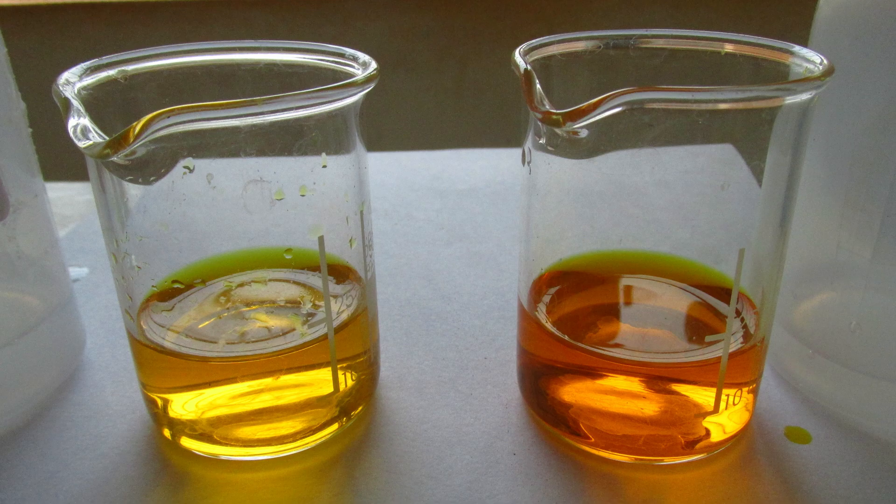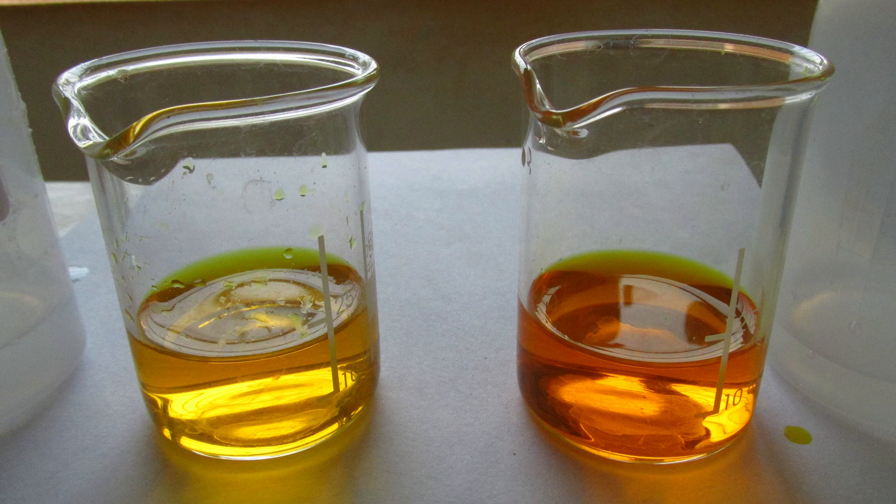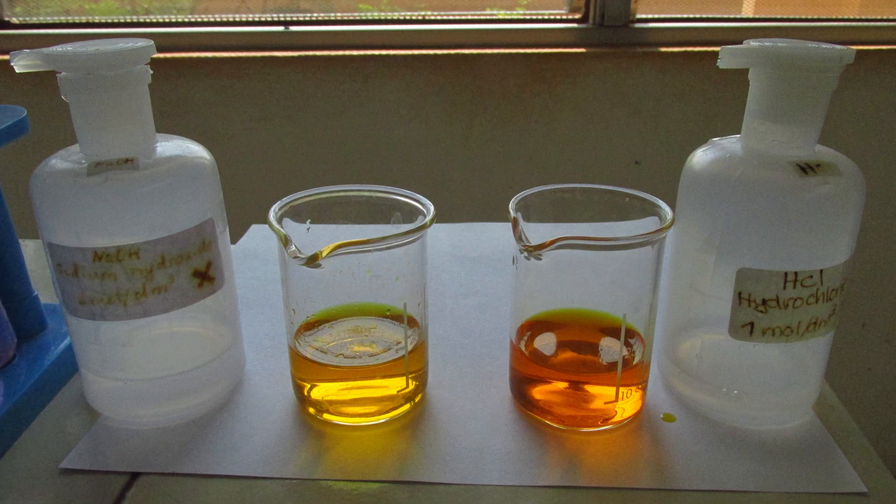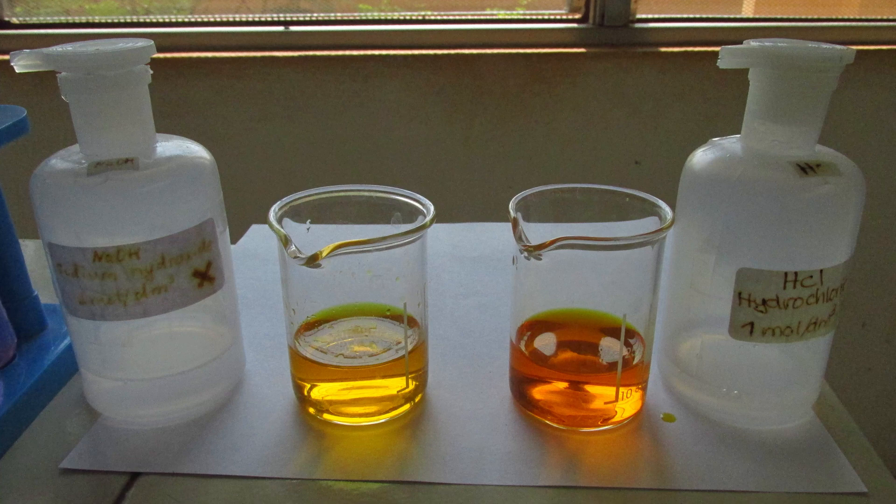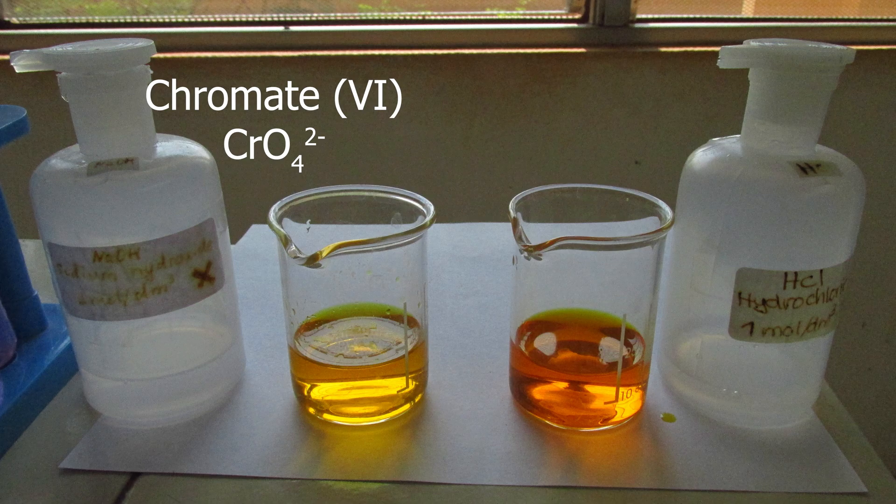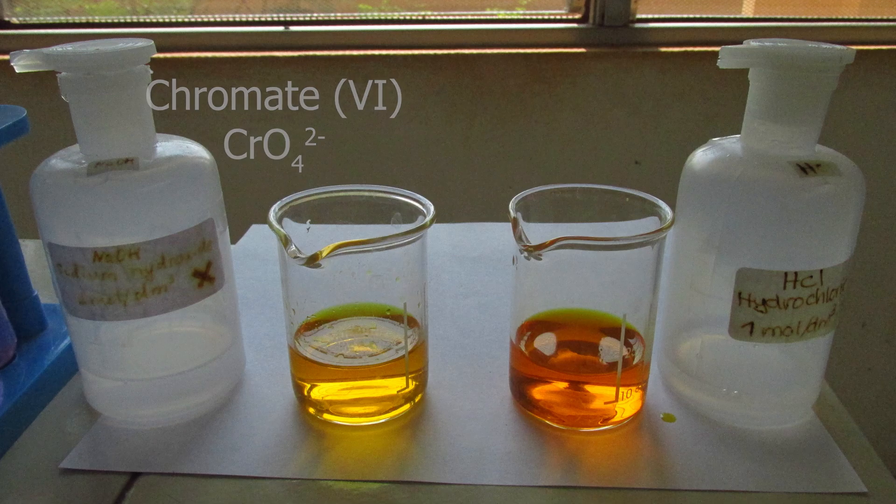Here on the right, I added hydrochloric acid to potassium dichromate 6. And on the left, I added sodium hydroxide. You see, potassium dichromate changes into something yellow. Yellow color is due to ions of chromate 6. Here is the formula, chromate 6. So the reaction is reversible. I add acid, I change chromate 6 into dichromate 6.